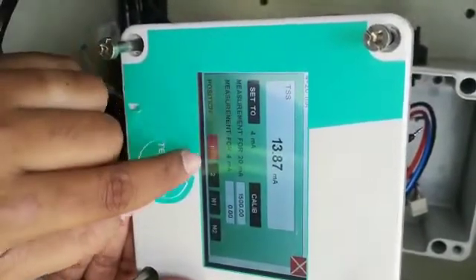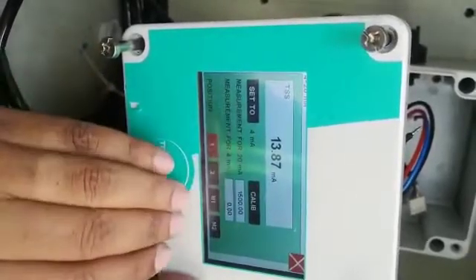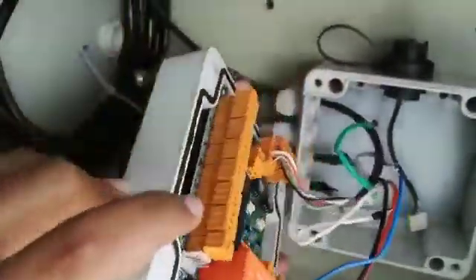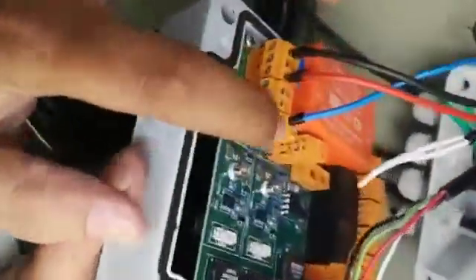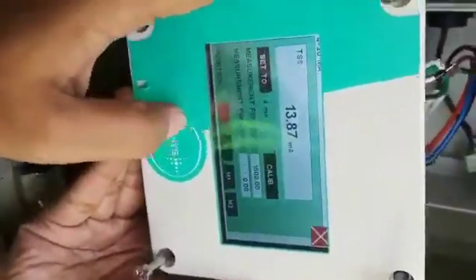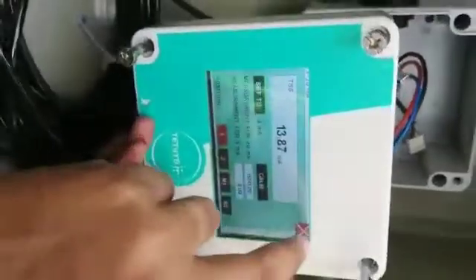The position — there are 4 ports for 4-20mA output. We have connected at the first port. This one is first, this one is second — this is M1 and M2. So we have selected port 1. Close it.